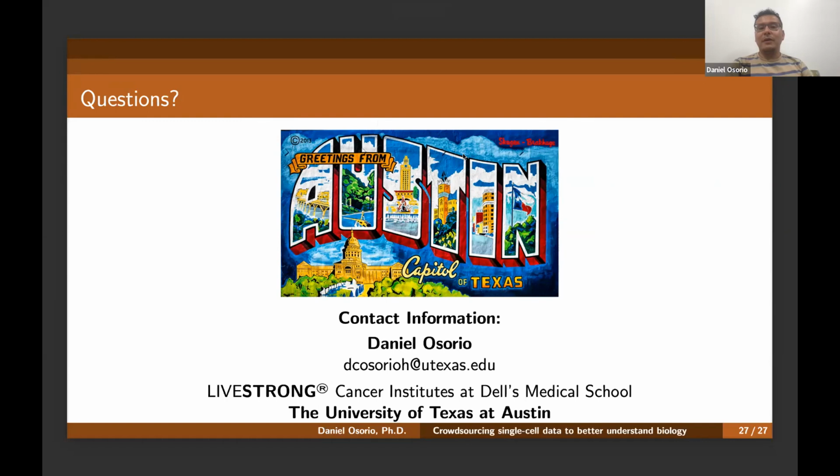Yeah, when we use crowdsourcing, we need to account for that. So I am an R developer. I pretty much use Harmony all the time. So we use the IDs of the samples where the data come from to reduce the batch effect and integrate all the samples. But this is just for visualization purposes and for normalization ones.